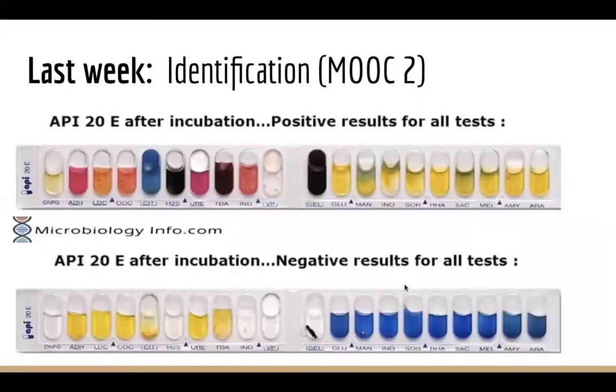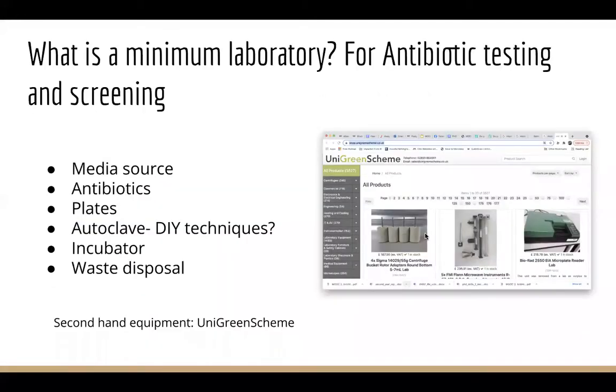So I think to start, we have a little recap. Last week we looked at the identification of strains. We found strains from the environment or in cultures, and then used a series of biochemical, genomic or molecular tests or assays to find out what strain that is. This week we're looking at those strains, which are now identified, and using these identified singular colony cultures, we're going to see what they are resistant to, or even test new drugs.